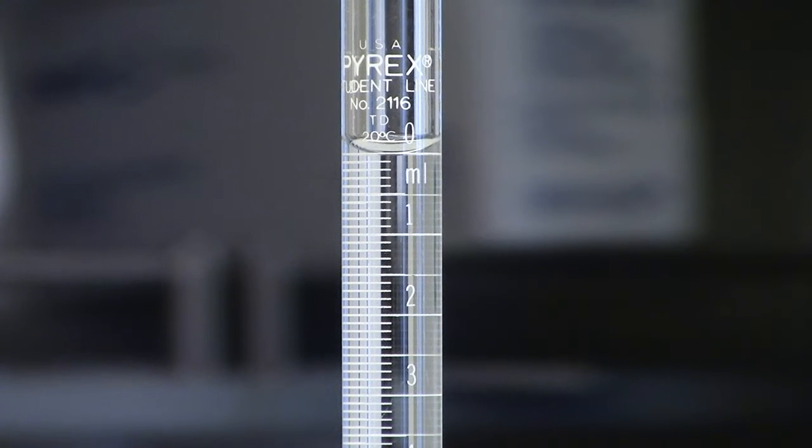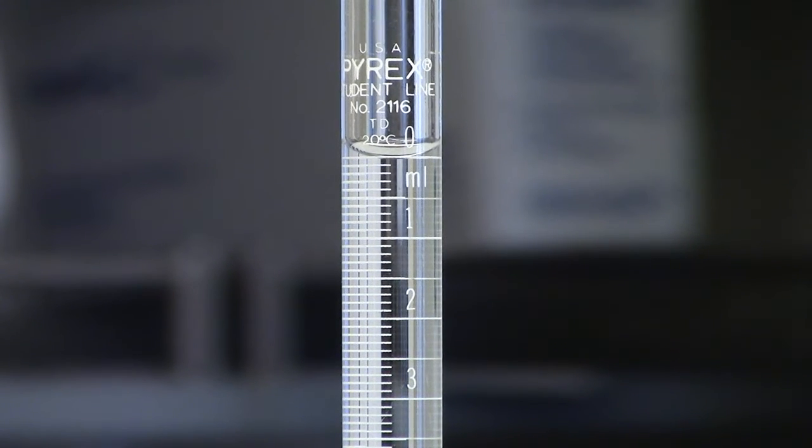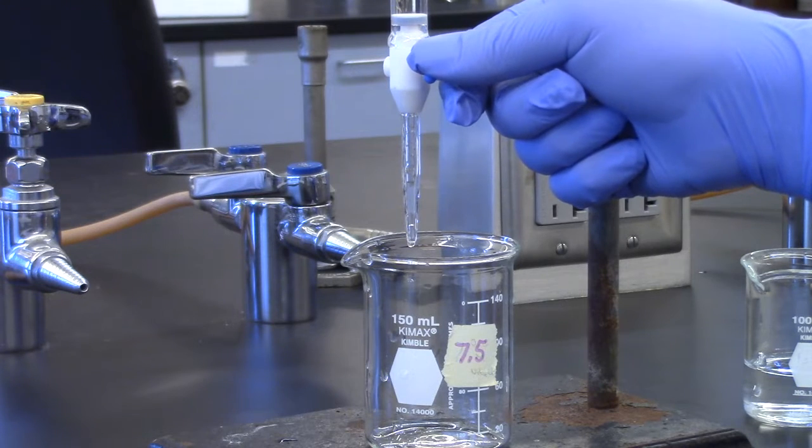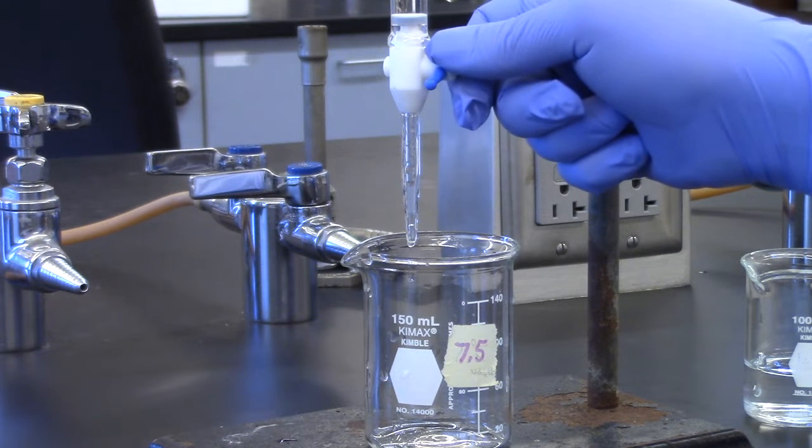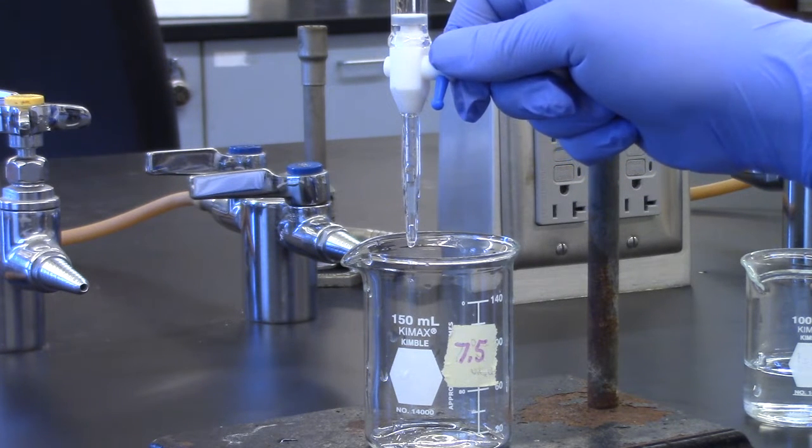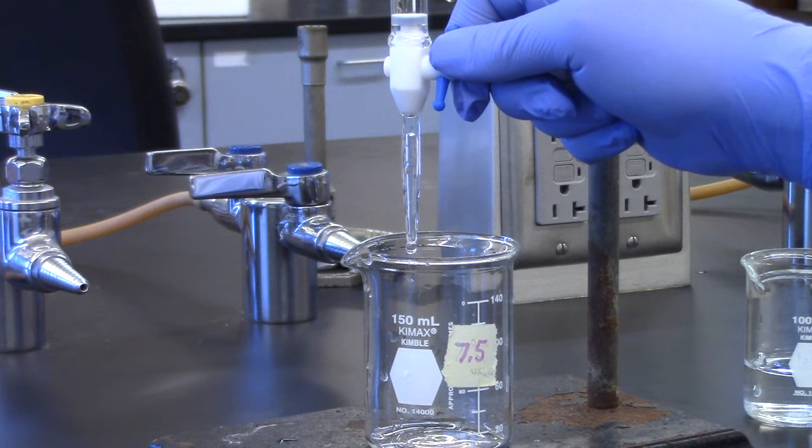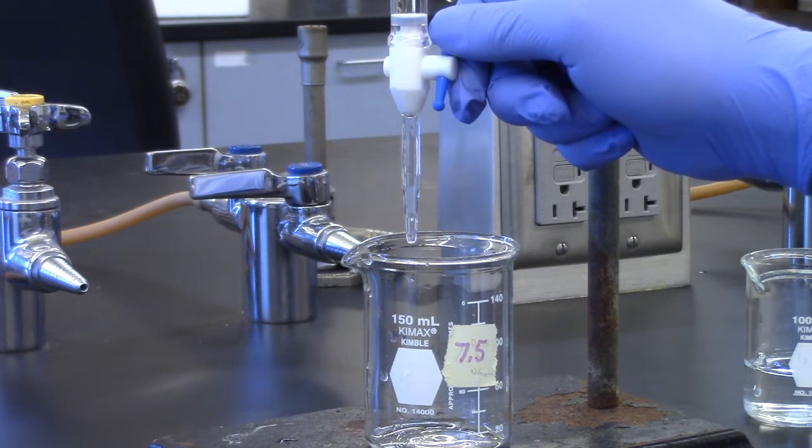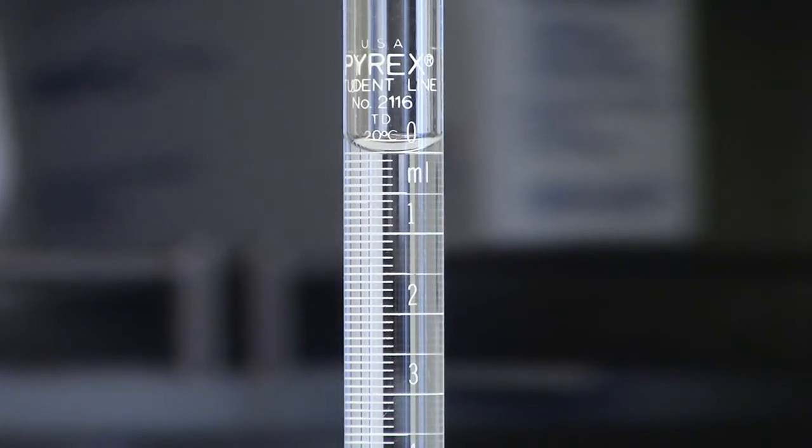Fill burette with distilled water to the zero mark. Inspect the tip to be sure that there is no air in it. If there is air in the tip, open the burette to get rid of the air and fill the tip with water. Refill burette to the zero mark.